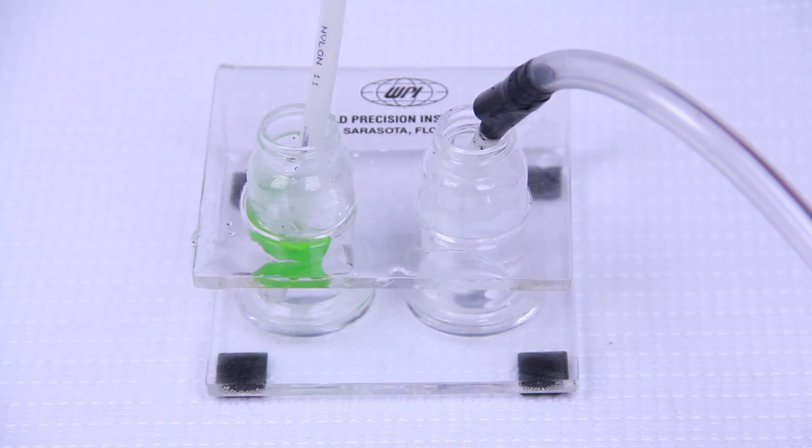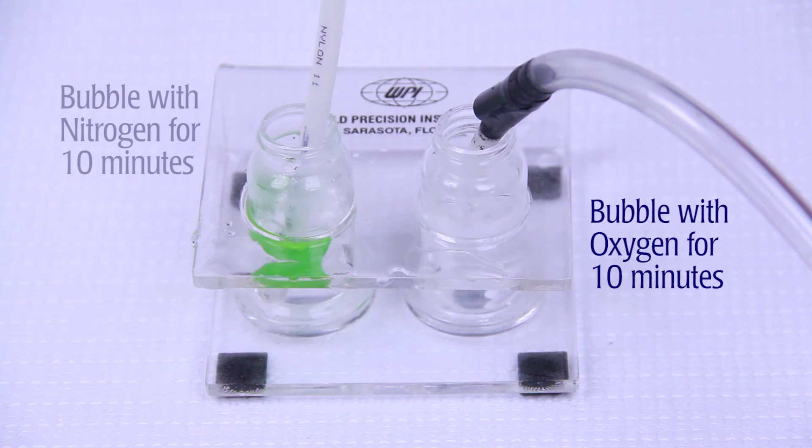Prepare a solution of 100% dissolved oxygen by bubbling with pure oxygen. To have zero percent dissolved oxygen, bubble that solution with pure nitrogen.